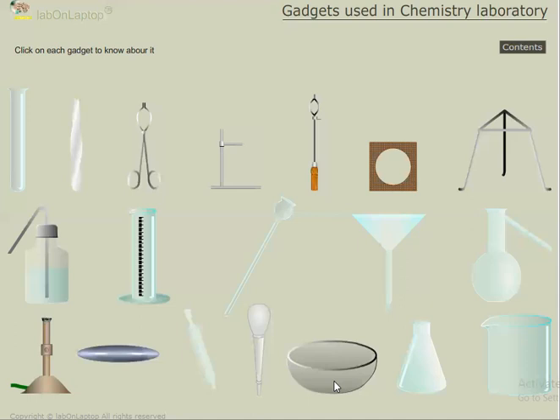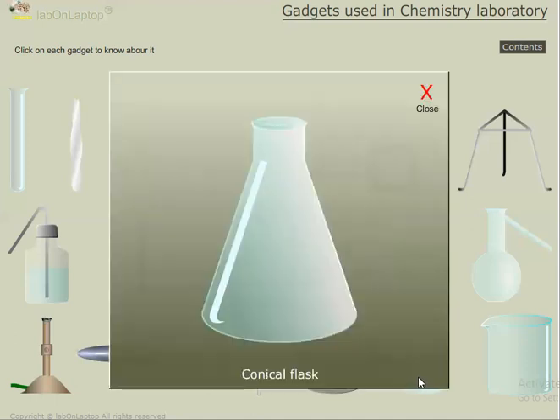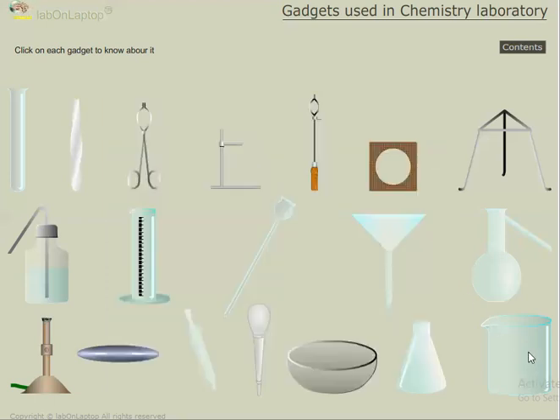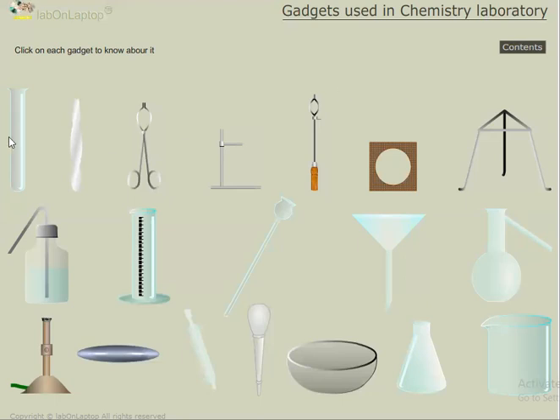And this is what we call a flask or bowl, an evaporating dish. Simply this dish we will keep on this tripod stand. And this is a conical flask. Conical means it is in the form of a cone, that's why we call it a conical flask. And this is a beaker, a cylindrical shape beaker. So these are the basic gadgets which we will use in our chemistry lab.